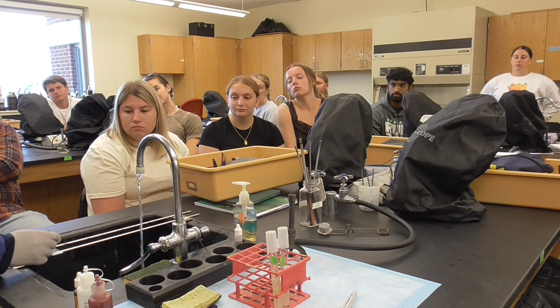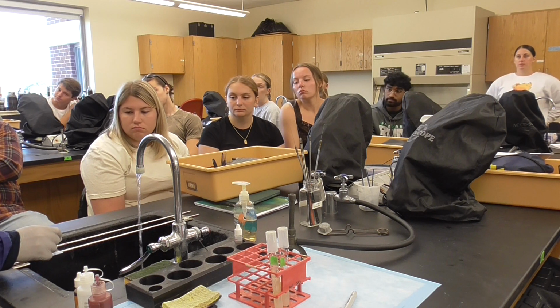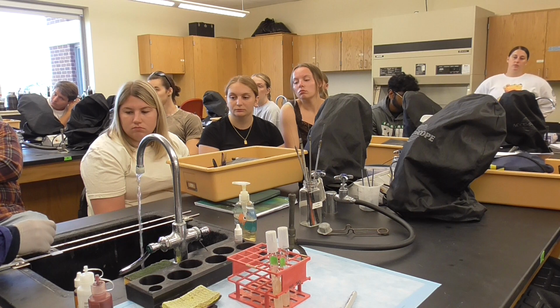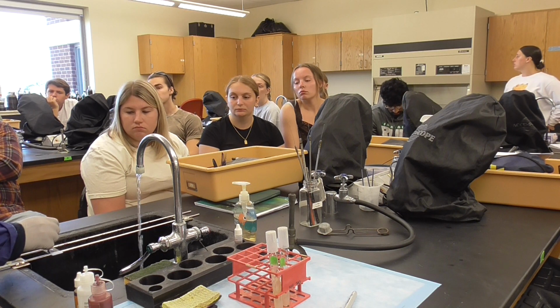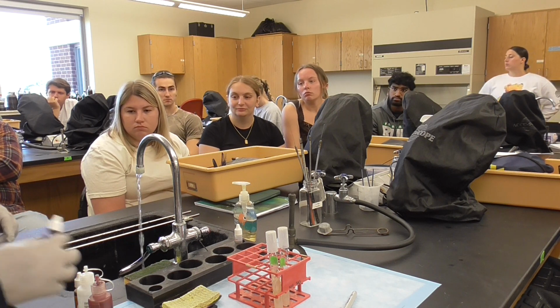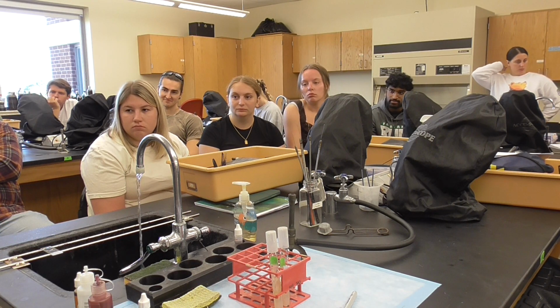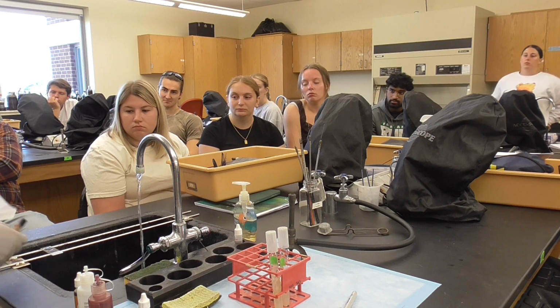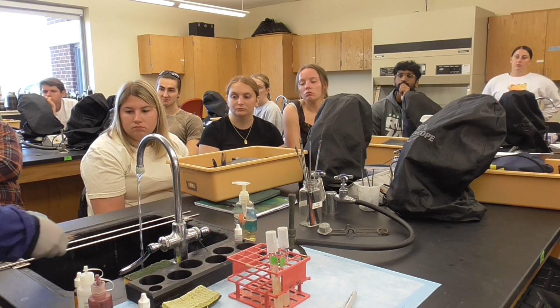Okay, this procedure is simple. Crystal violet. So you add a drop of crystal violet right in the middle. Okay, there's not too much left. Crystal violet, staining 60 seconds. You can count Mississippi for 60 seconds, but you don't really have to do it that long. Let's say 60 seconds is ready, so we're going to rinse like that.